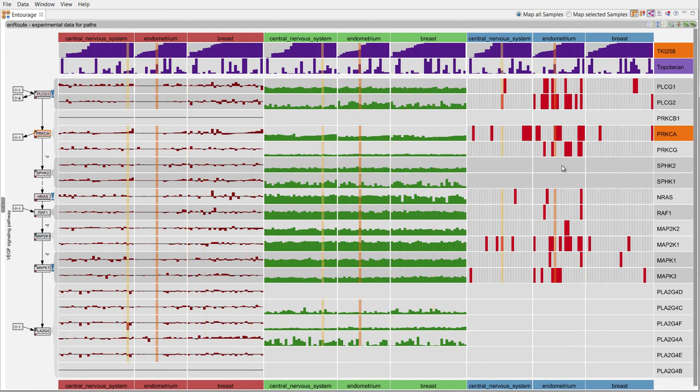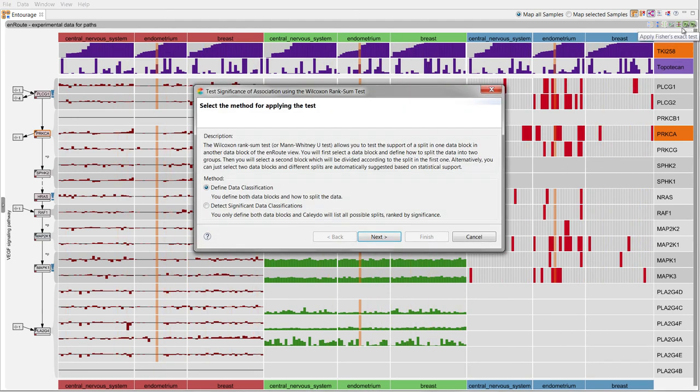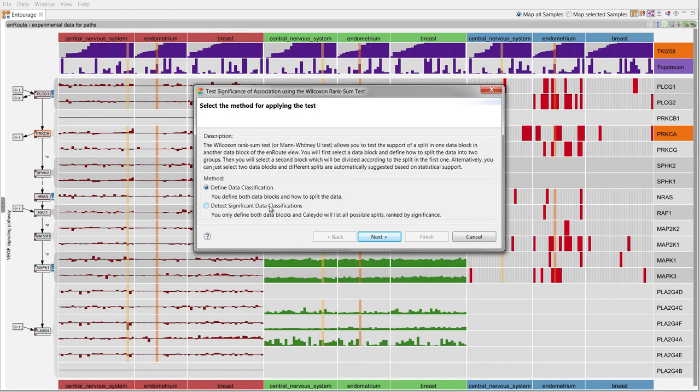An alternative test we provide is the Wilcoxon rank sum test. While Fisher's exact test is widely used to compare categorical variables, the Wilcoxon rank sum test is better suited to detect differences in the distribution of continuous variables for two different classes.